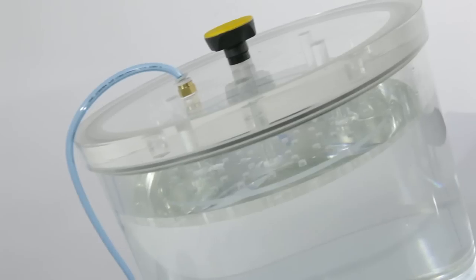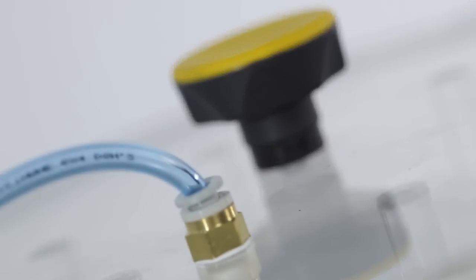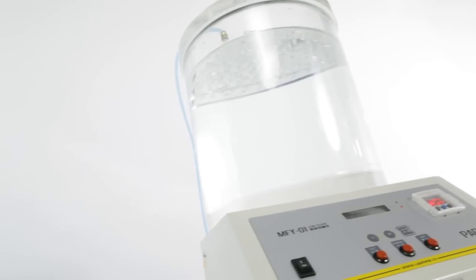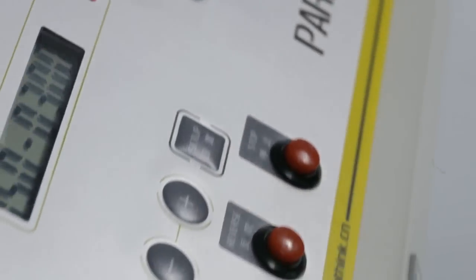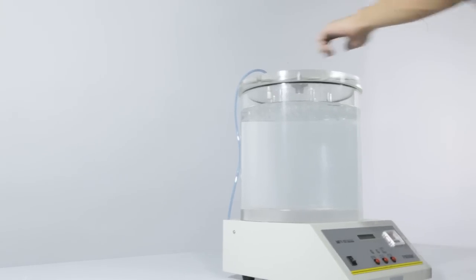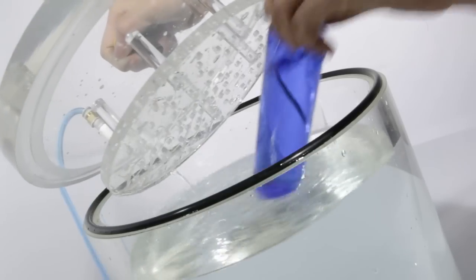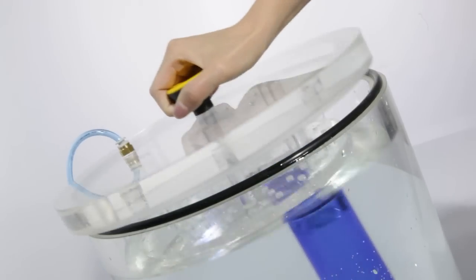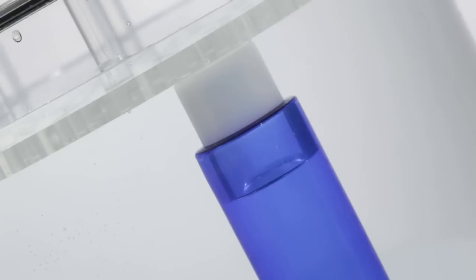Test termination and air back flush functions make the entire testing process totally automatic and reliable. MFY-01 works by creating a vacuum in the test chamber to create a pressure difference between the inside and the outside of the specimen.